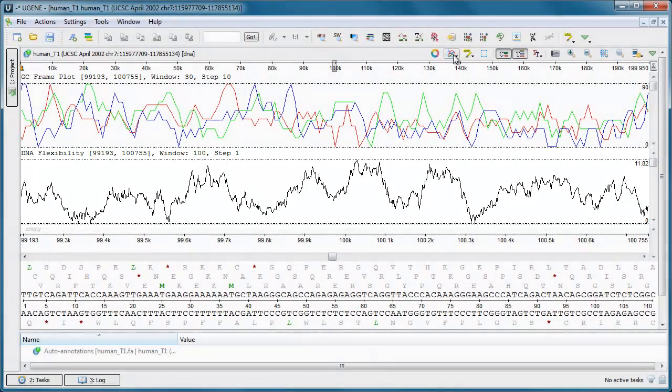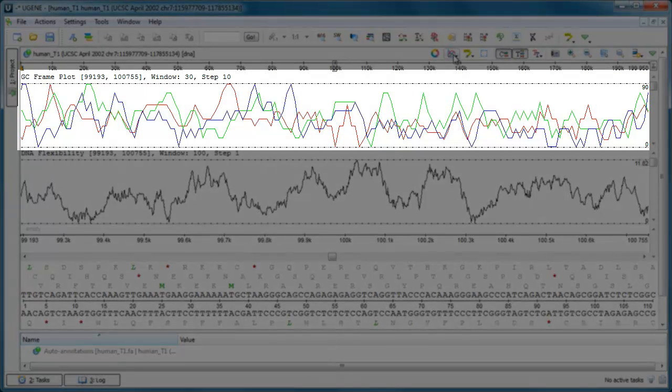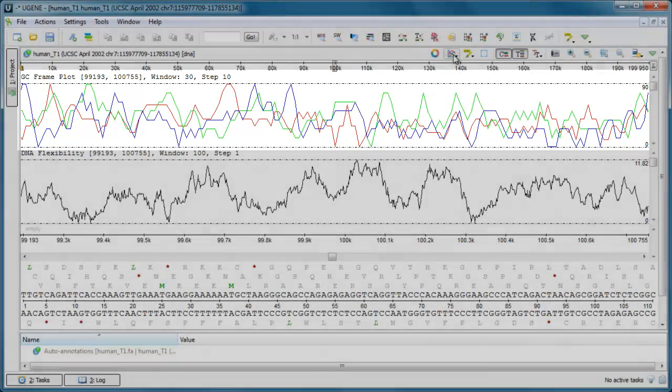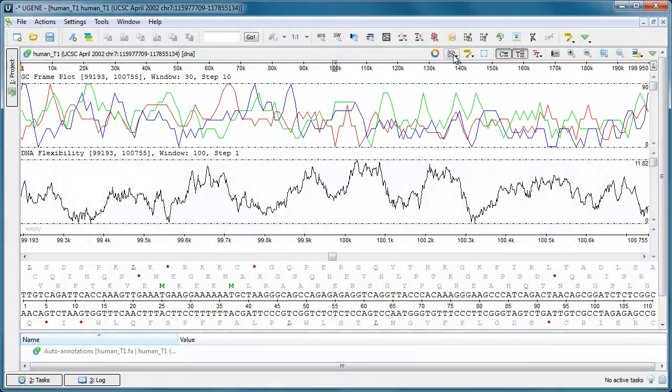The GC Frame Plot Graph is similar to the GC Content Graph, but shows the GC content of the first, second, and third positions independently. This can help you identify gene starts in high GC genomes.